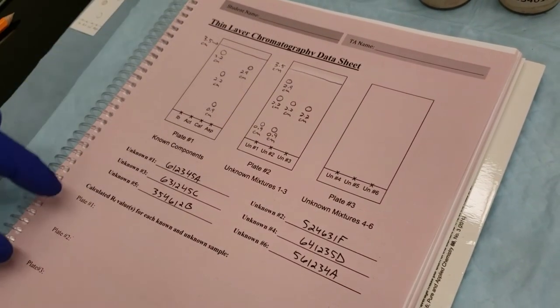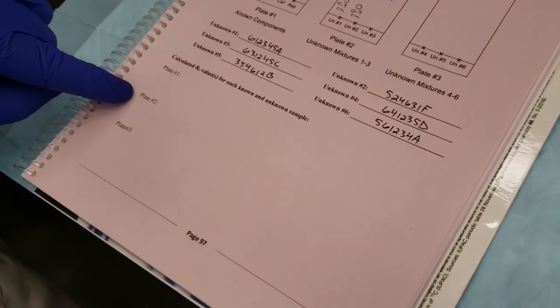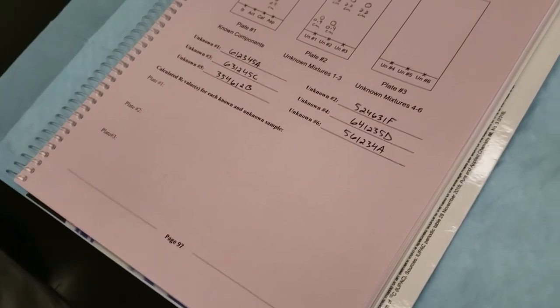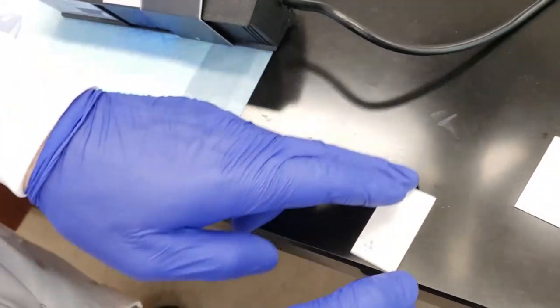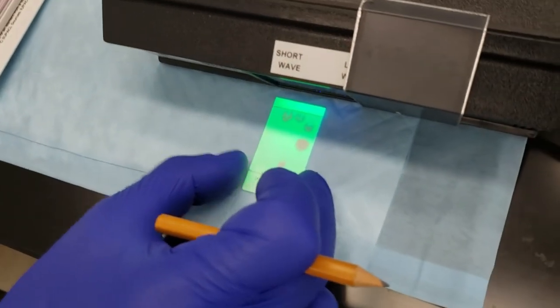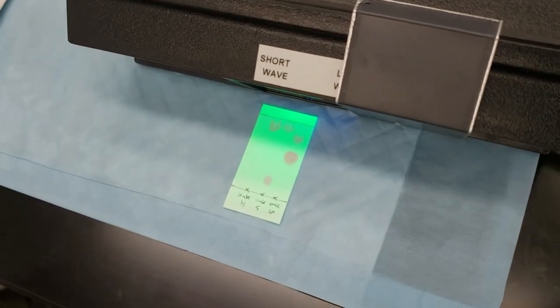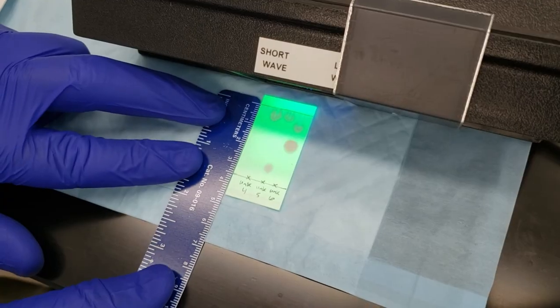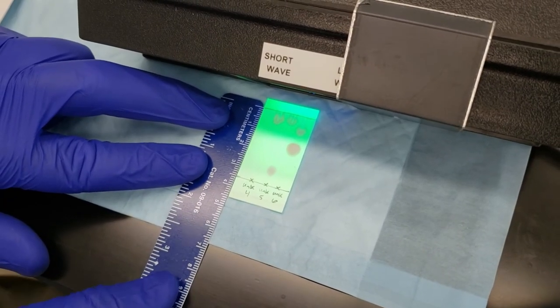Just like you did for the first plate, you'll use these values to calculate the RF values for plate number two and all of the components contained in these mixtures. Let's move on to our third plate. Third plate has unknown number four, five, and six. And we'll do the same thing that we did for the other two plates. First, we'll measure our solvent line. That comes out at 3.5.